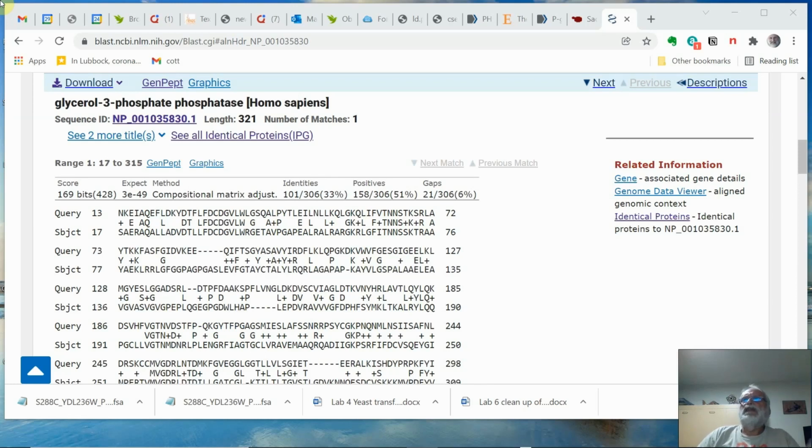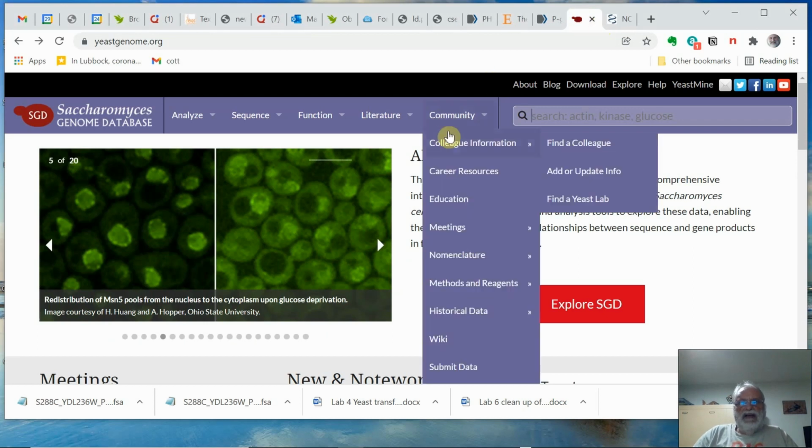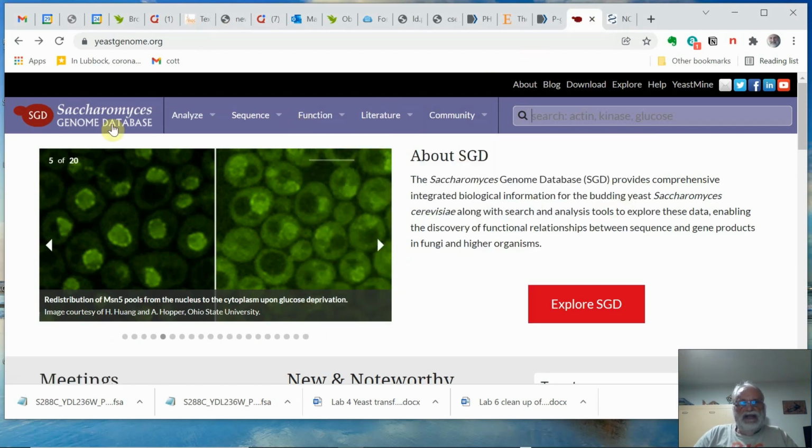Everyone, in the continuing theme of little video tutorials on various things that you need to do for the various assignments and projects in the lab class, I have one where we're going to download sequences for assignment 1 and probably assignment 2.